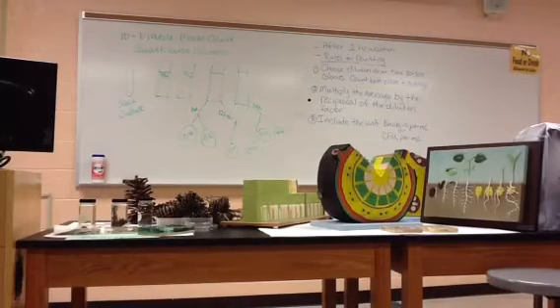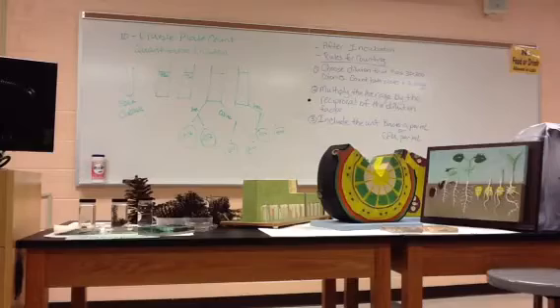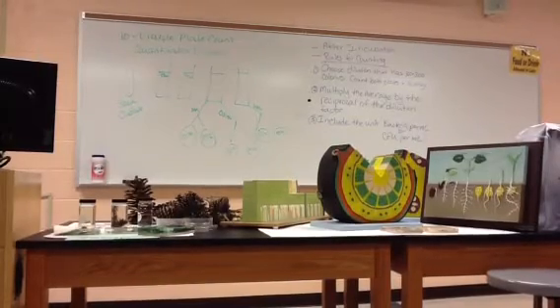So when you got a tube from me that was turbid, okay? We're trying to find out, in this nice turbid, cloudy tube, how many bacteria are in here. That's the purpose of the viable plate count. How many of them are still alive?